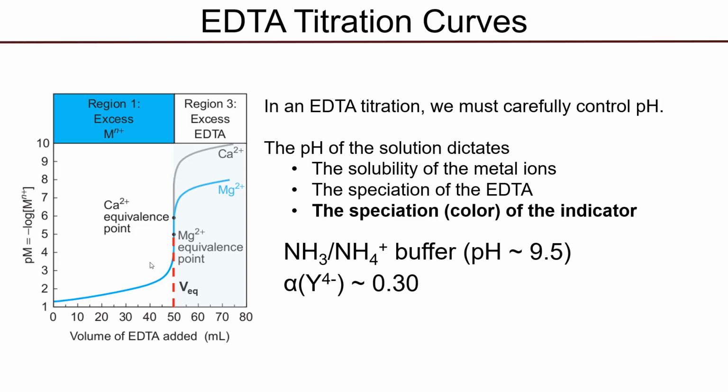And so that's the whole thought process that goes into the titration's design. And then when you have an established procedure, you can reap the rewards because you're saying, I want to know how much volume I have to add to get the color change to do this. In reality, to establish that procedure, a lot of chemistry had to be thought out behind the scenes, and then it's just written up stepwise, and there's your procedure. So I hope that in this last little segment, we have shown you a little bit about what goes into an experimental design behind the scenes.